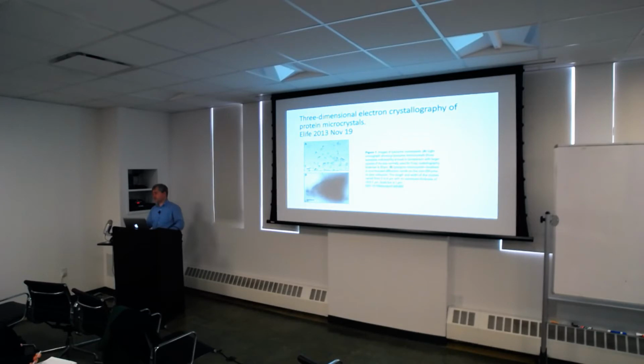With a typical 3D crystal, you're in the 10 to the 9 to 10 to the 12 range of scattering things, whereas by single particle, 10 to the 6 is big. For this, it's probably maybe 10 to the 8 or 10 to the 9. I don't know, you'd have to figure it out. But technically the E-beam is less damaging to the crystal than the X-ray beam. X-ray beam has a lot of energy.